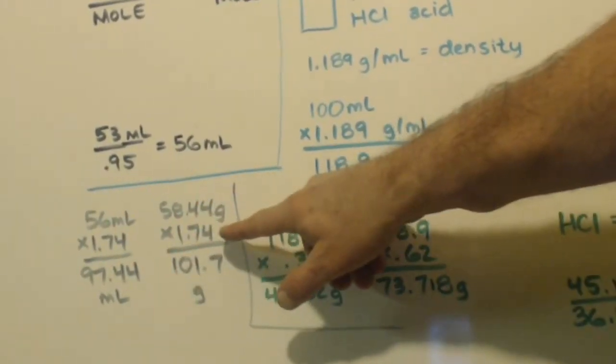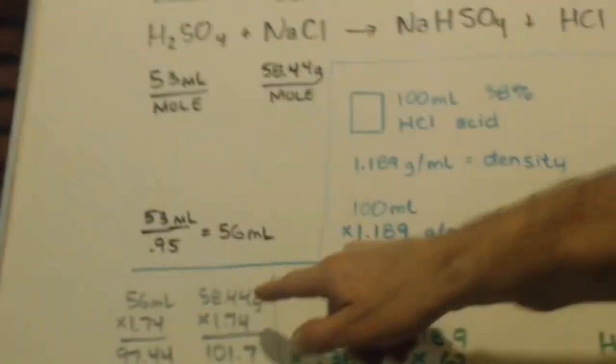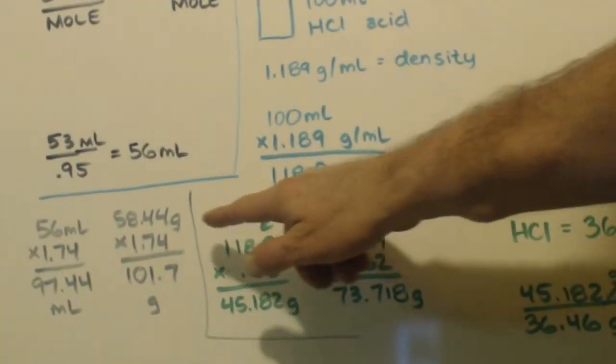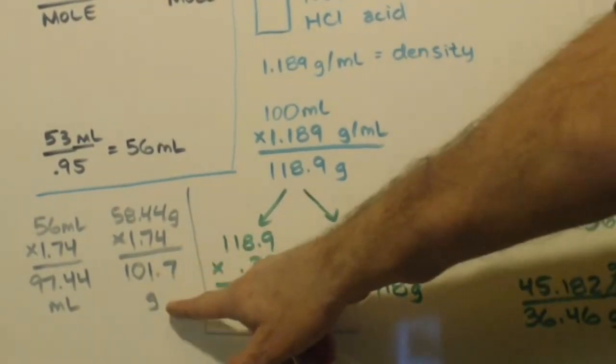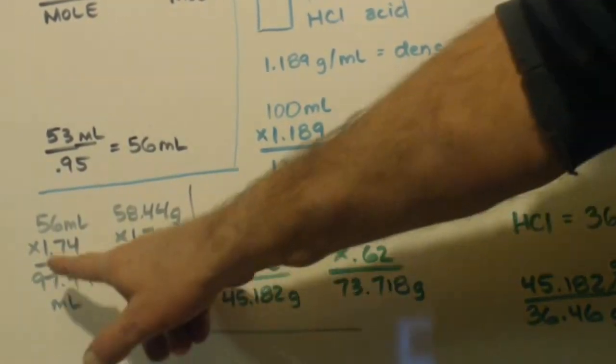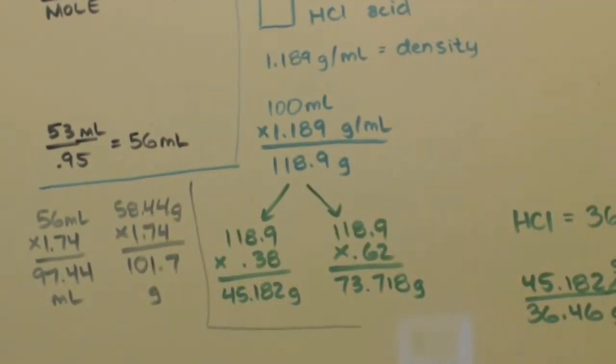This is the sodium chloride, remember? Sodium chloride was 58.44, so I took that times 1.74. That comes out to 101.7 grams of table salt. It comes out to 97.4 milliliters of sulfuric acid.